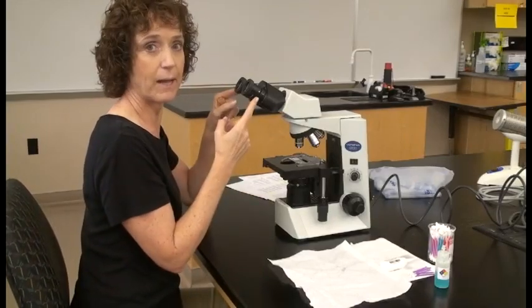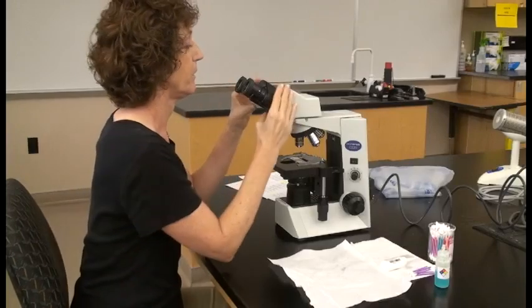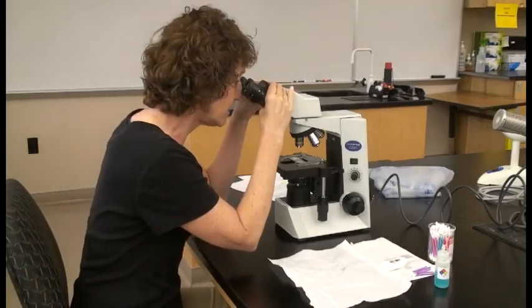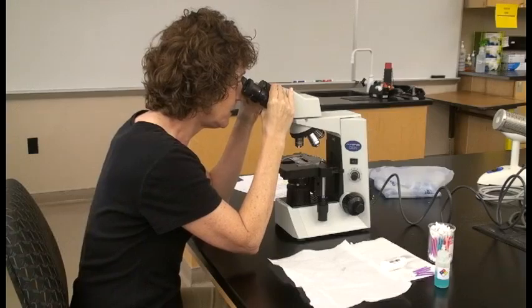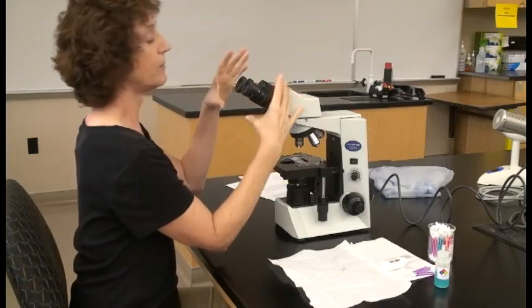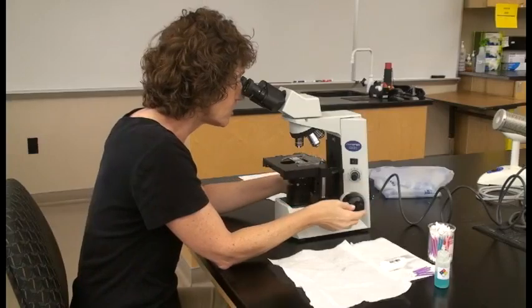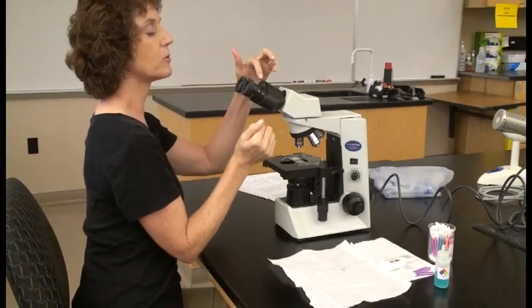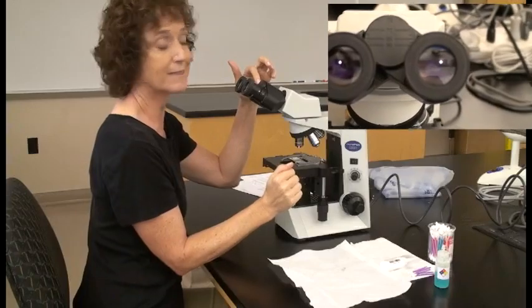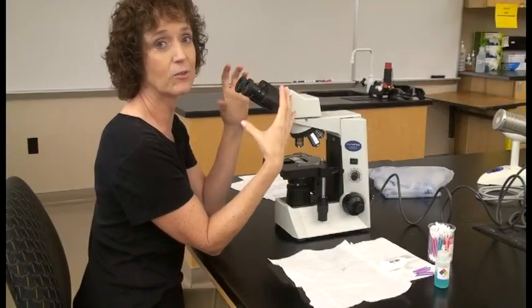We want to see one field of view, so we're going to adjust the binoculars to set the interpupillary distance. Just like binoculars, you increase or decrease the distance between the oculars until two circles of light mold into one circle of light. There are little notches so you can note your interpupillary distance and go right to it next time.